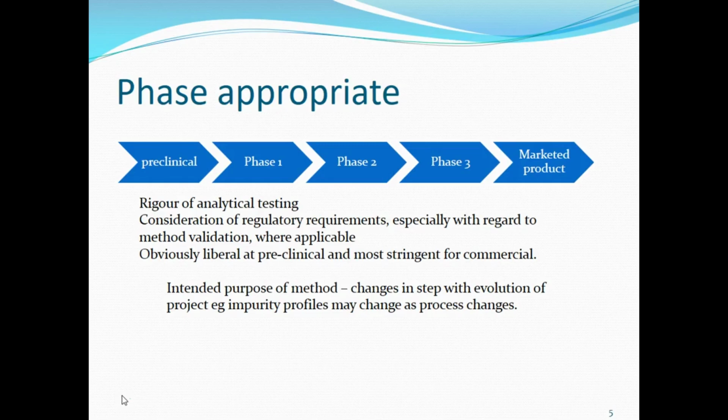So minimally we should do some forced degradation studies or some stability indicating studies on your method at this point. It's important also to be aware of your mass balance, which is your purity and your impurities. Obviously not all impurities will have the same response factor, but we do assume that they're close to 100% at that point until we develop the method further.